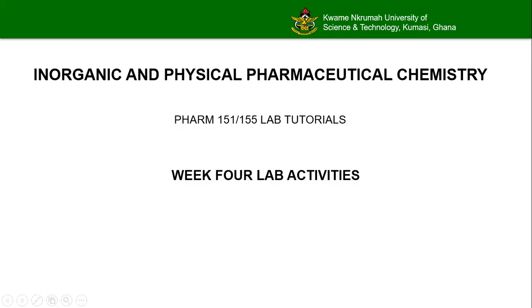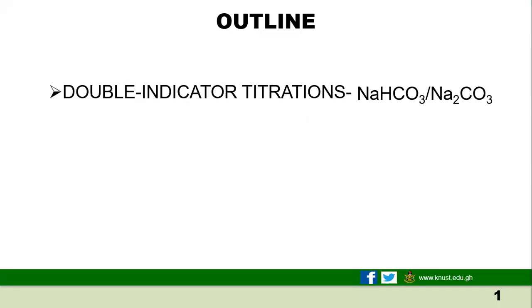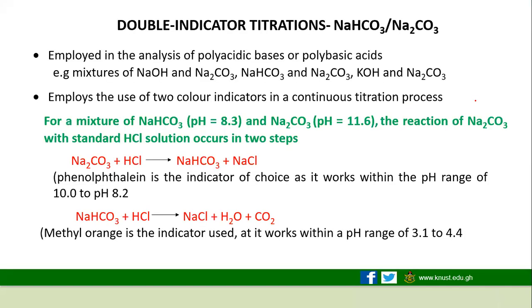All right, so welcome back once again. Now we are continuing from where we left off. This is the lab week 4 activity. We are doing double indicator titration, and this one focuses on a mixture of sodium bicarbonate and sodium carbonate.